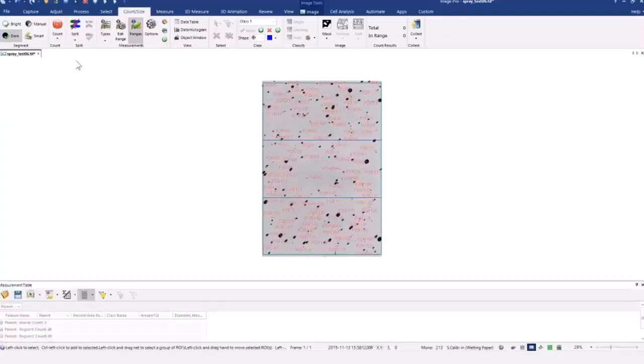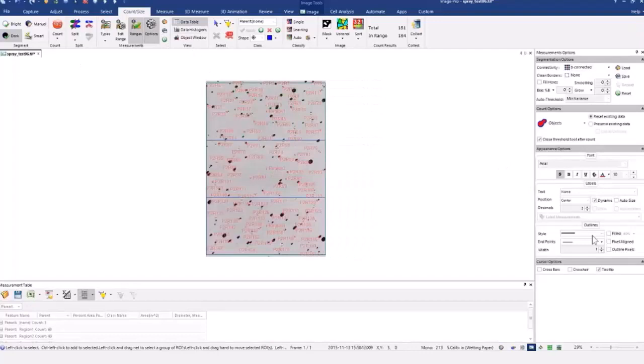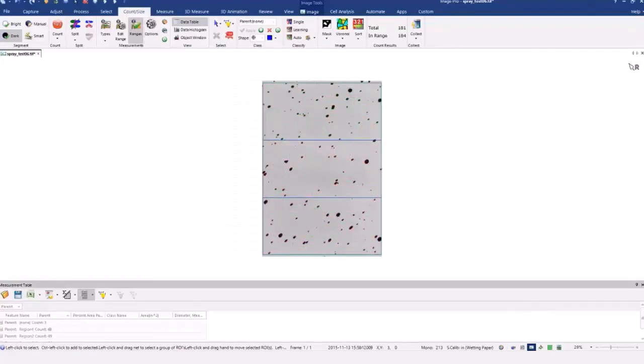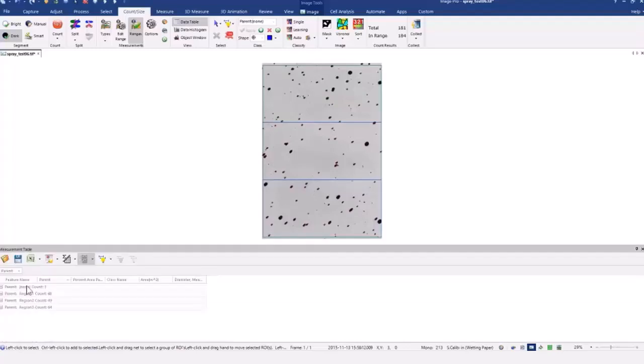And I'm going to count by ROI. So automatically, let me take off those names just to clear it out a bit and set none. But it's now color-coded each of these regions. And I have the data per region now.